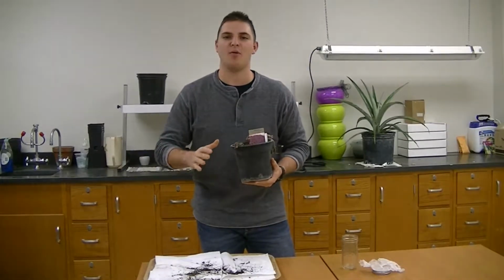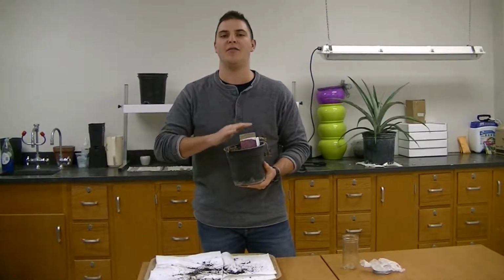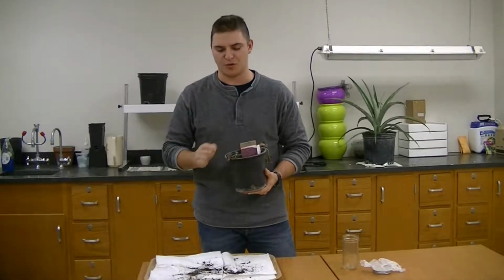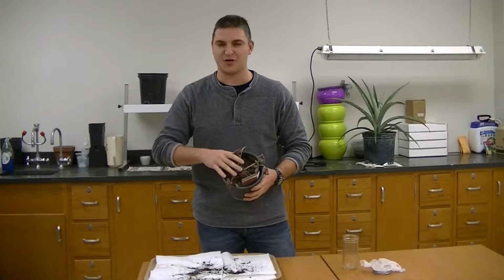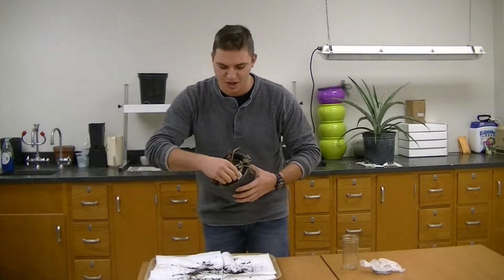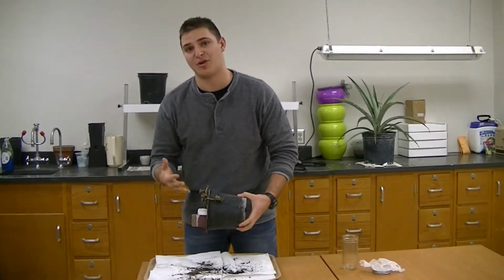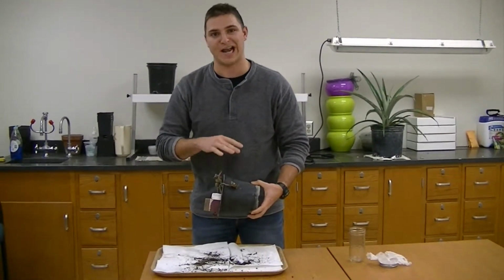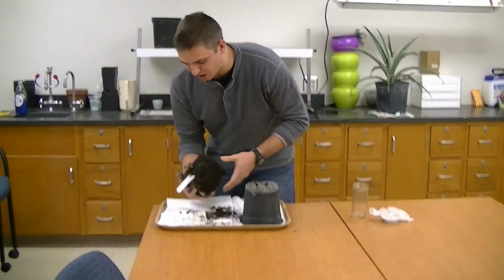So the biggest problem with some of these root rot diseases is that the actual symptoms of the infection are not visible. You'll see general overall maybe some stunting and loss of vigor of the actual plant, but you don't see the actual symptomology. So the first thing you have to do is unpot what you're working with, or dig up the crop in the field if you're working in an agronomic crop. And what you want to do is look for some live roots.